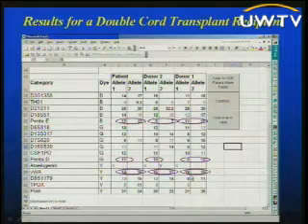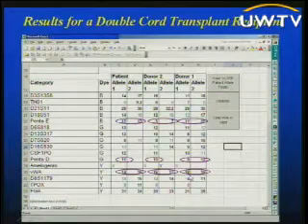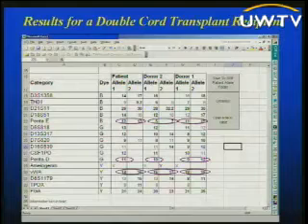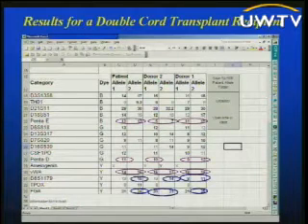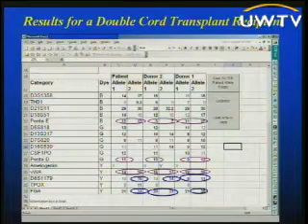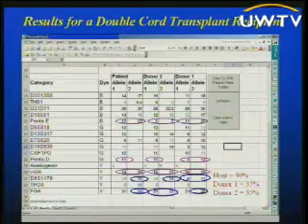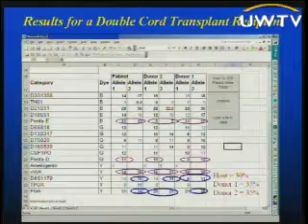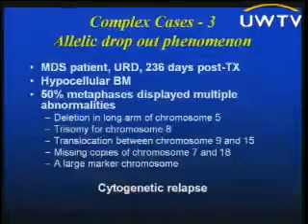But as I said to you, we do not like to restrict ourselves to a minimum number of alleles. We try to extend the number of loci to the maximum number possible. So if we made a few adjustments in our calculations and we adjusted for a few things, you can use two additional loci, which are not ideal but can be used. And so using the information from all 5 loci, we could determine that essentially this individual was a true 3-way mix, 30% host, 35% of each of the cord blood units.